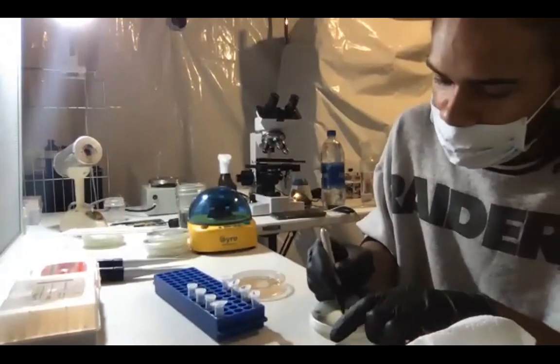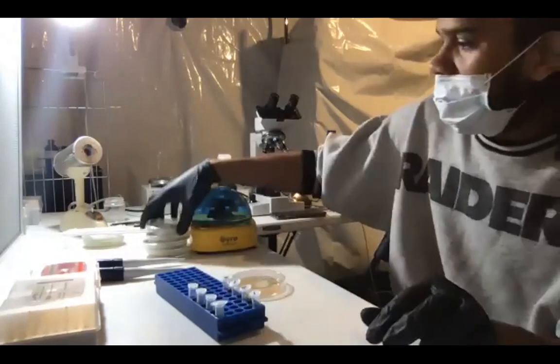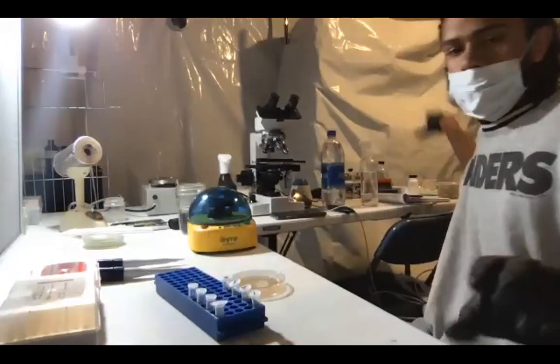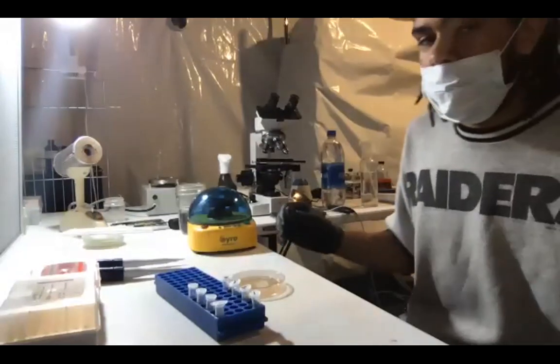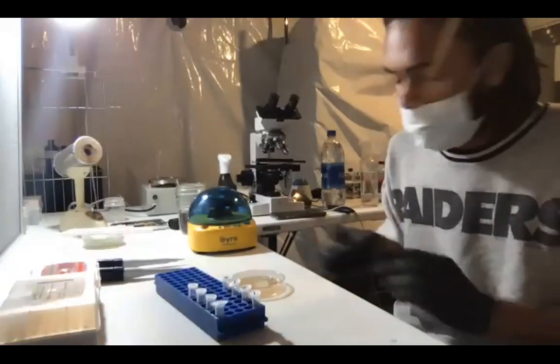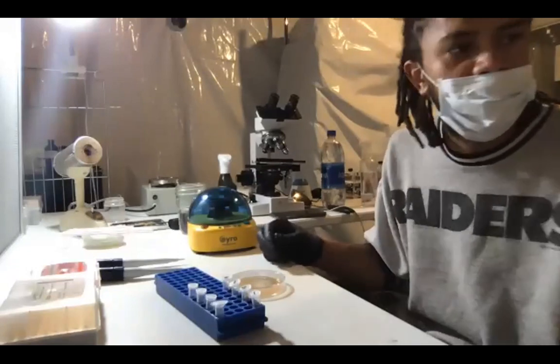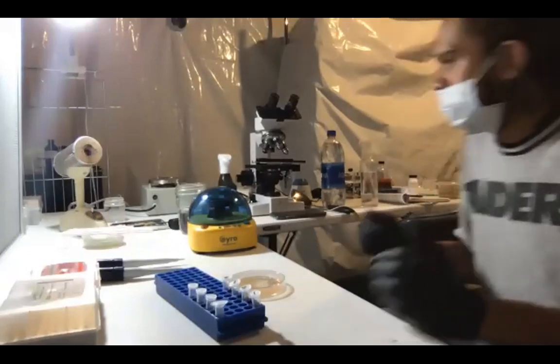All right, so this is number 4. I'm going to set these off to the side. And the next thing I'm going to do is get my extraction solution, which I have a video on my YouTube that shows how to make extraction and dilution solution. So I'm going to go get that out of the fridge.